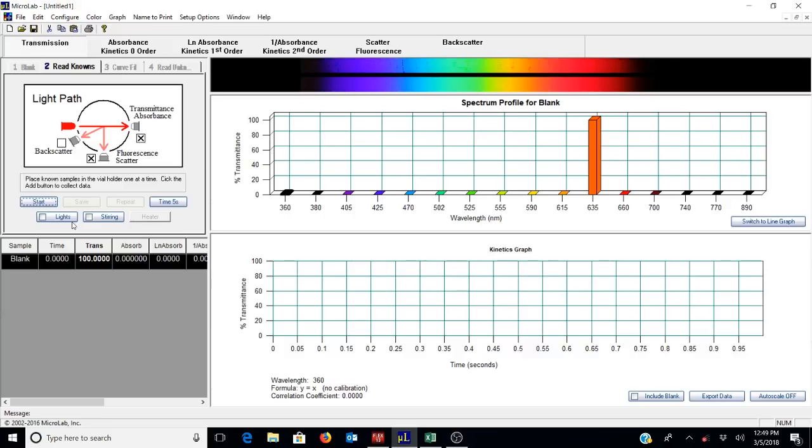This part is actually critical to how you do the experiment. So you need to mix NaOH and some amount of water and some amount of dye as prescribed by the lab manual into your vial. You do not want to add the bleach yet. What will happen when we add the bleach? It's going to start to react, right? And we can't have that until we're ready. So what we want to do is I have the bleach separated into this little vial ready to add on its own, and I will add that just before I begin the experiment.